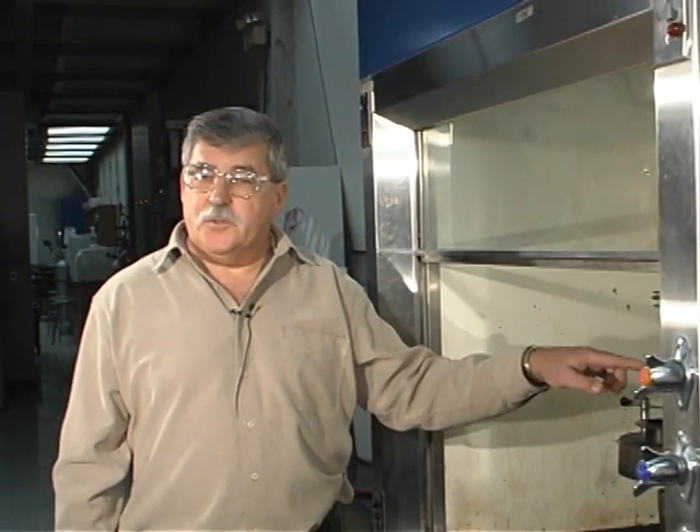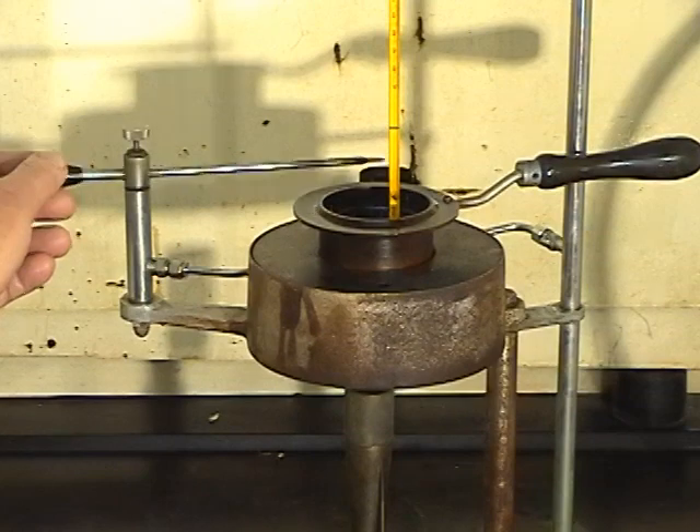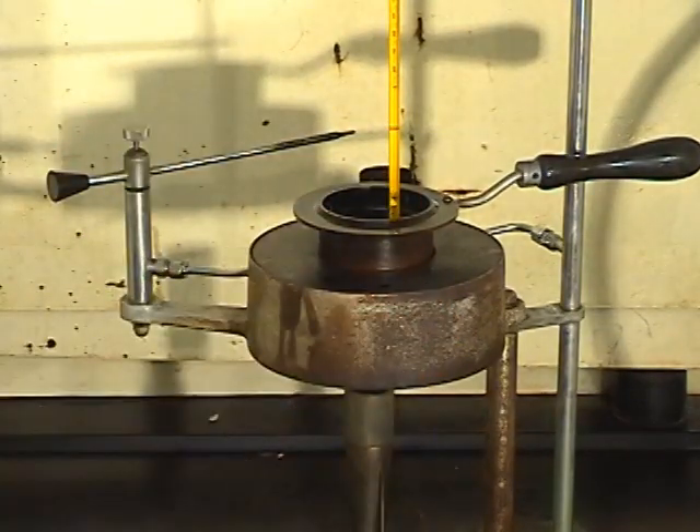So the second we get the blue flame we're going to record the temperature. We may let a few seconds go by and try one more time for a second demonstration, but after that we're going to stop so that we don't reach the fire point temperature.